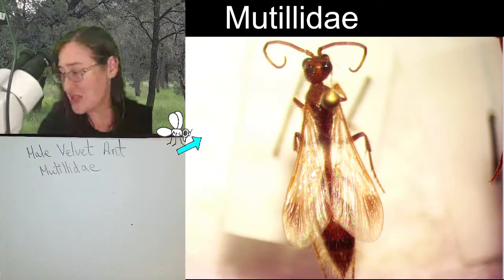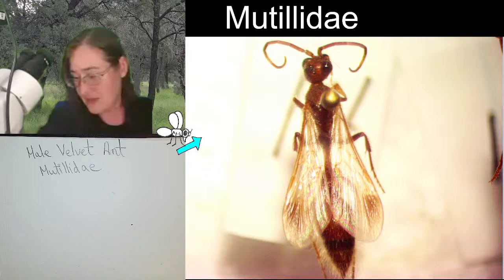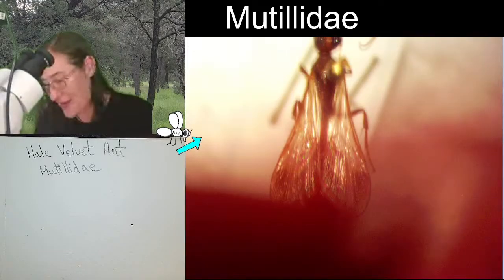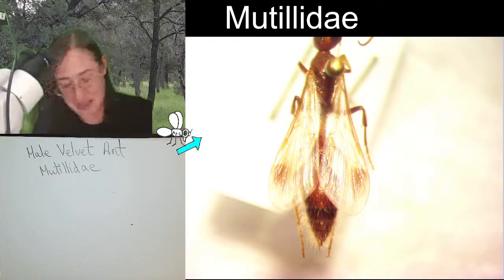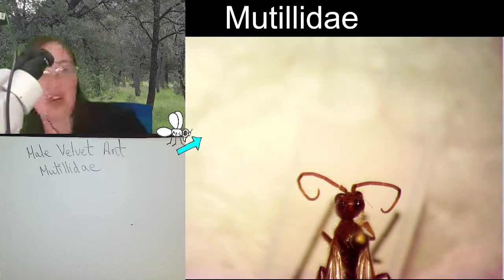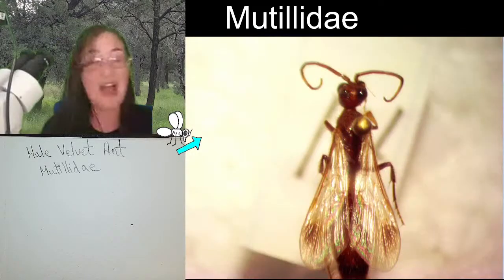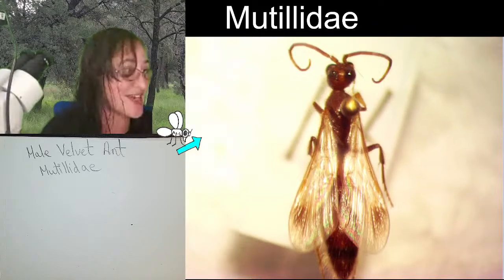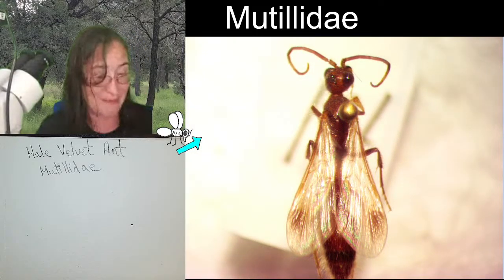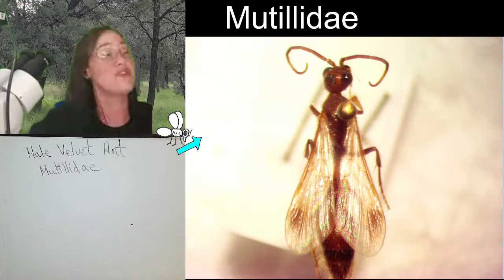With this specimen here, let me go put the other two specimens away so we don't bump them on accident. Don't need to be bumping brand new specimens. After using my collection to teach for over a year and a half now, I now realize why the teaching collection at MSU had so many missing body parts on the insects. You know, just interacting with them, even if you're super duper careful, you end up breaking little pieces.